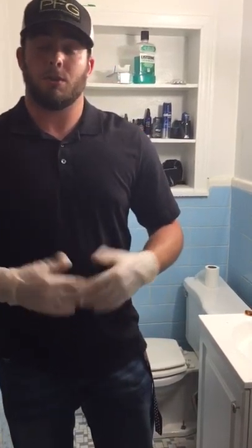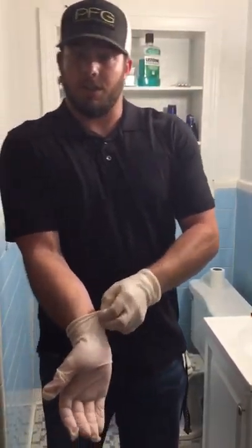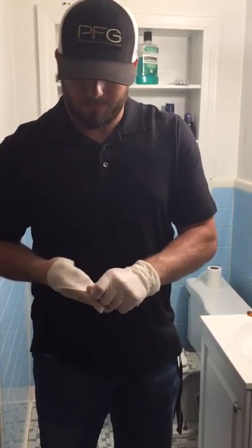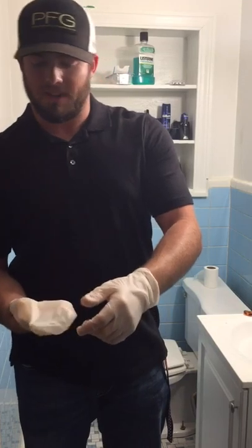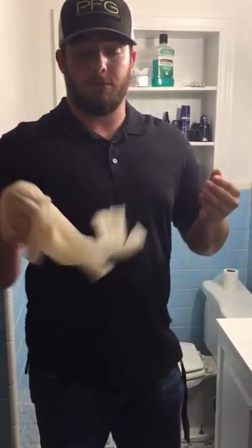Once you're done with your gloves or helping the person in need, you're going to take them off by pinching the wrist and rolling the glove down — about halfway, then all the way. You're going to take the glove that you've rolled down and hold it in your hand, then pinch the wrist of your other glove and pull it all the way off, inside out.